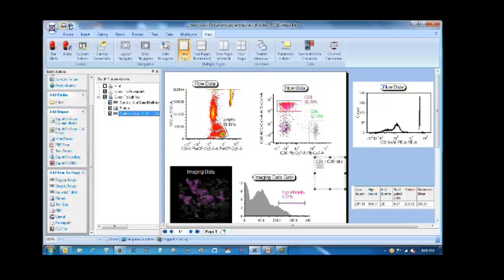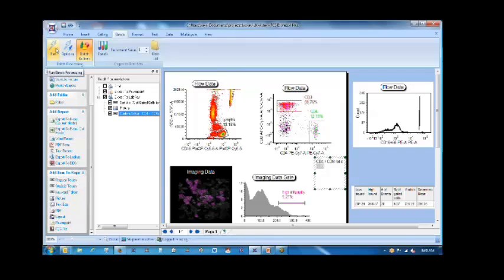We're pretty much ready to go. When I click run on the batch tab, it's going to send everything out to LabKey, and it's also going to generate that PowerPoint export, which is the whole results of our layout. Just to mention, there are other file types you can export to LabKey. I think pretty much any file type, if I'm not mistaken. We could export the layout itself, raw FCS files, whatever you would need to export to LabKey server you can do. But we're just doing these 3 for today.